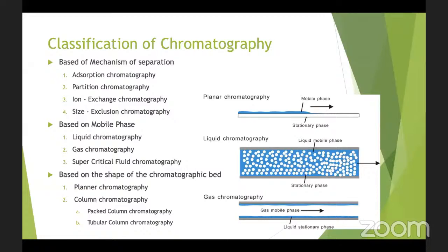In planar chromatography, the separation bed is on a planar substrate. Example, paper chromatography, and TLC, where silica gel is dried on a glass or aluminium surface.